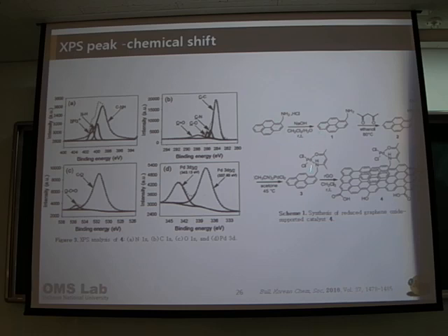Even though there is no coordination, because after preparation I washed this one with fresh solvent several times. But that is not the answer that I want to hear. Still, you have all the peaks. I understand you have the peaks for the palladium and the CO or whatever. But still, there is no evidence from this XPS that you have a coordination between your GO functionalized amine and your palladium, isn't it? Do you have any evidence that there is a coordination?